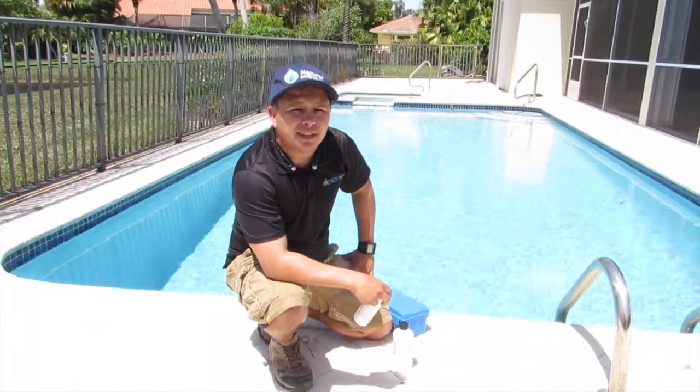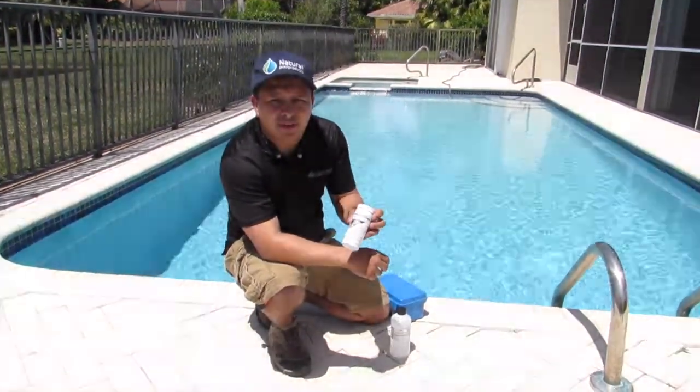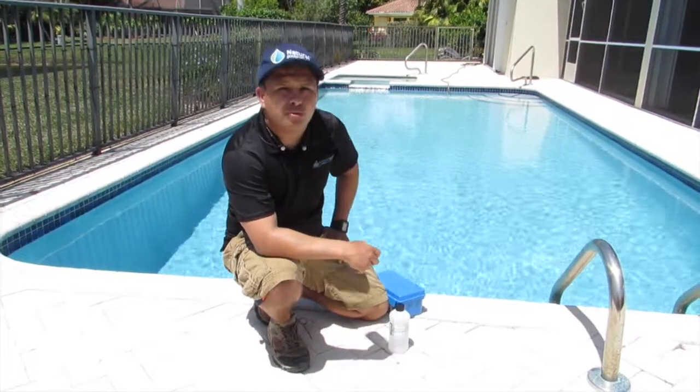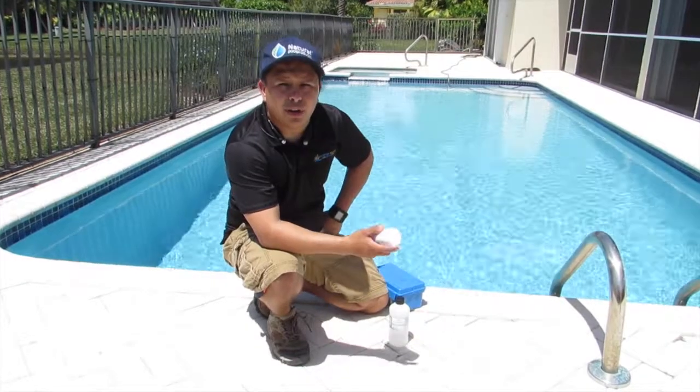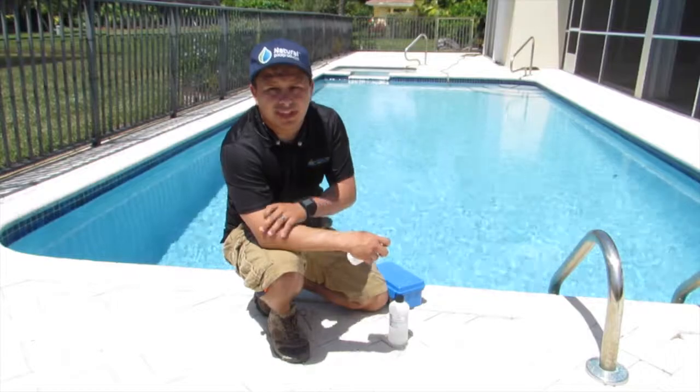Hello guys, we're here in Boca today. We're going to do another test using the AquaCheck phosphate test kit. A lot of pools go green with chlorine and people aren't aware why, and when we go to pools we see a lot of phosphate in the water.